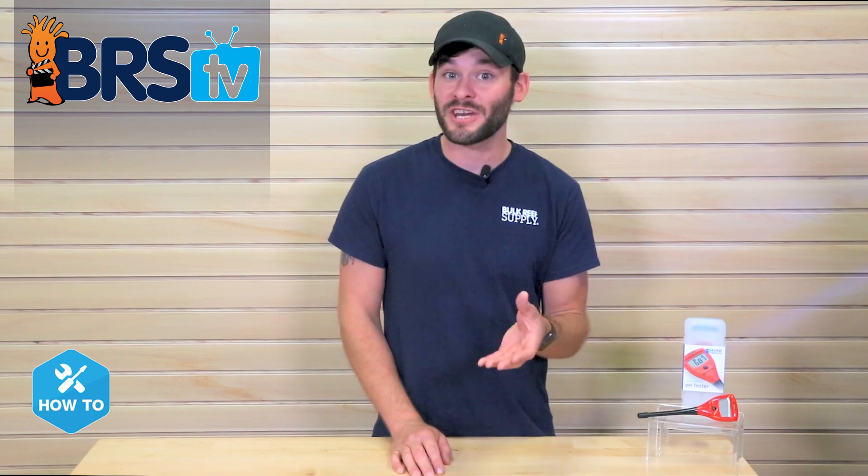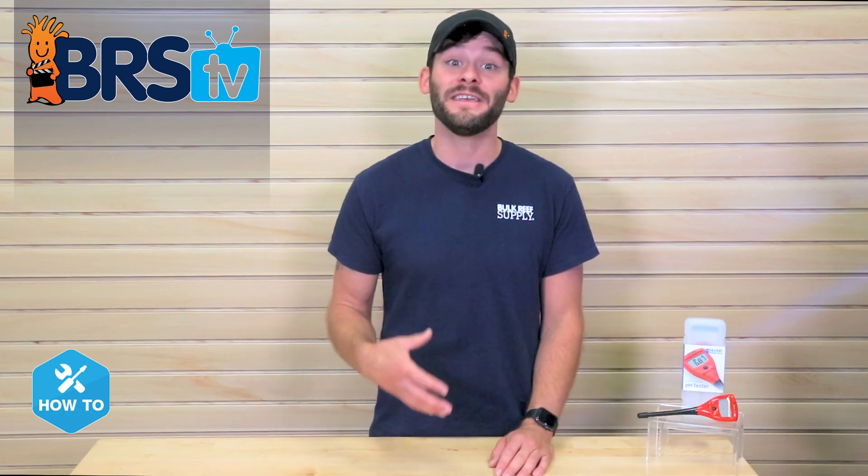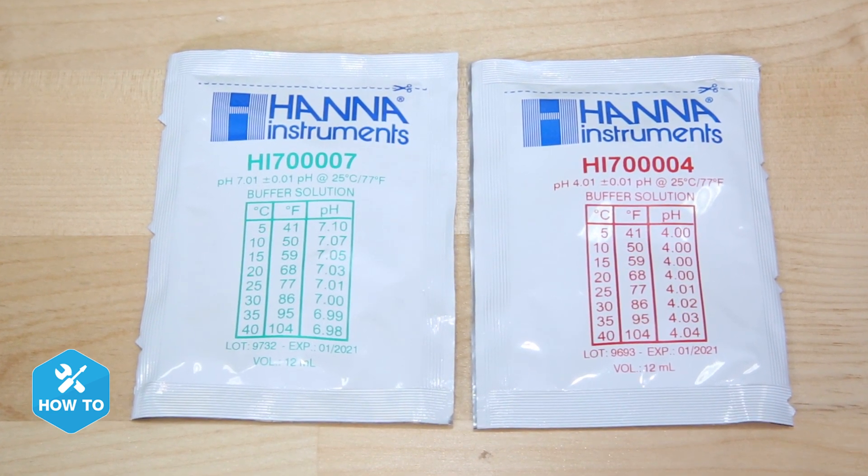Where some pH pens or checkers only have one calibration point, you can calibrate the Hanna pH Checker with two points, which will end up providing you with even more accuracy down to the hundredths. Not only that, but it comes with a couple calibration solution packages to get you started.